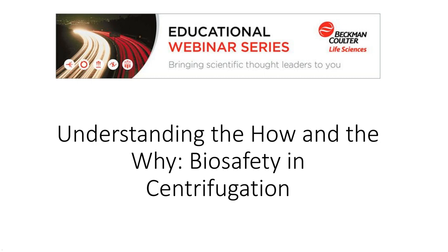Yes, and you hit it, Laurie. The separation is relative to the difference in density between the particle and the solvent, which in this case is probably water. So if a particle is close to water in its specific gravity, it's going to be a difficult separation.